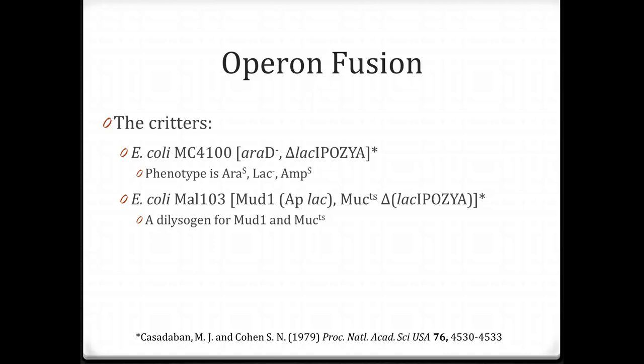It also carries mu-CTS, which is a normal working mu phage, except that the C gene of mu is temperature sensitive. So you can force the mu phage to go lytic at higher temperatures. This strain is also missing the lac operon.